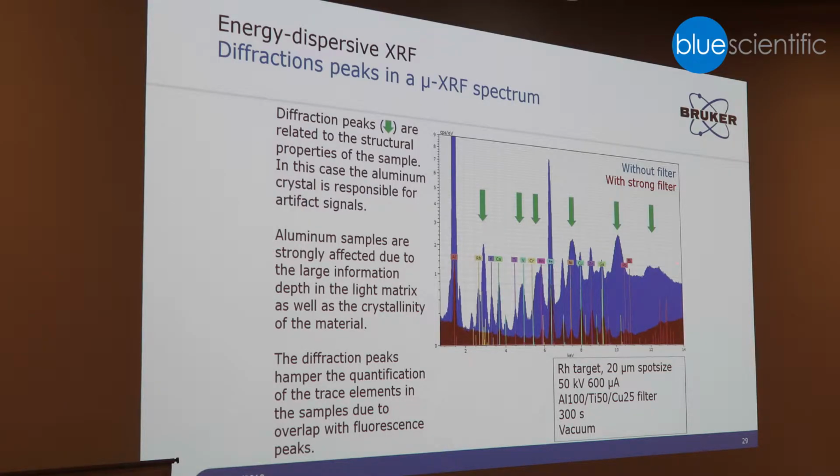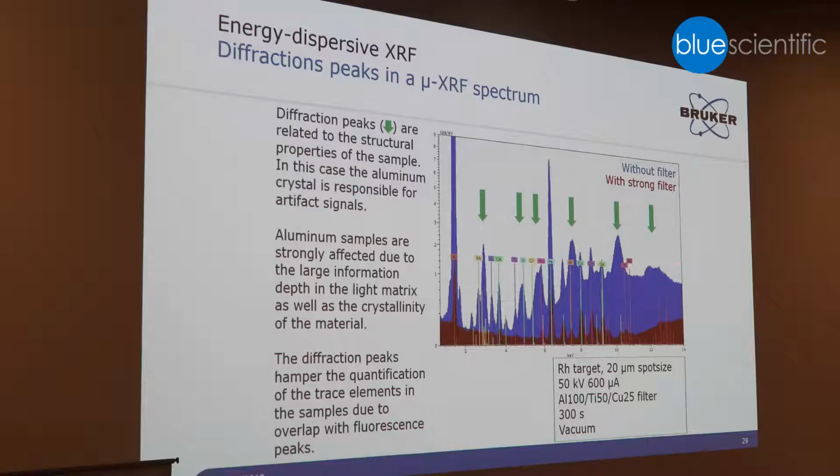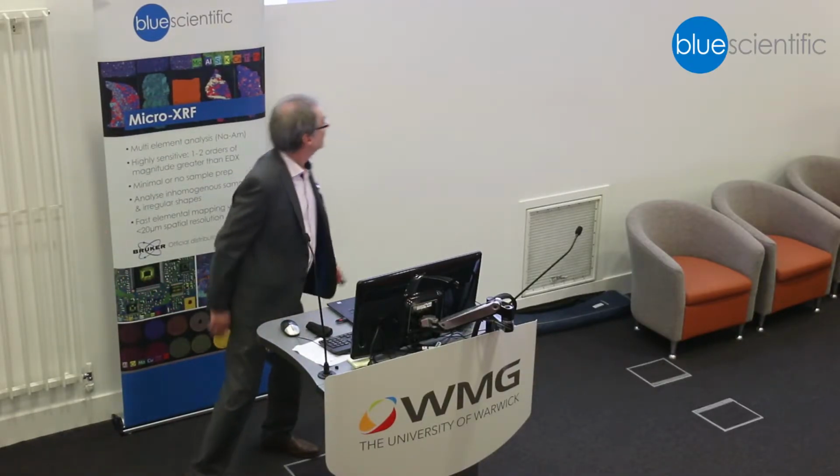The blue spectrum here is acquired with no filter, and you see a lot of very suspicious lines. You can already assume that due to the broadening of the line, it's not a fluorescence line, but it's not clear here. This is a sample where you may deal with a lot of different elements. If you use this sandwich filter combination, the result is the dark red spectrum, which is way cleaner, where you really see the distinctive fluorescence lines. So what is a disadvantage, however, could be utilized.